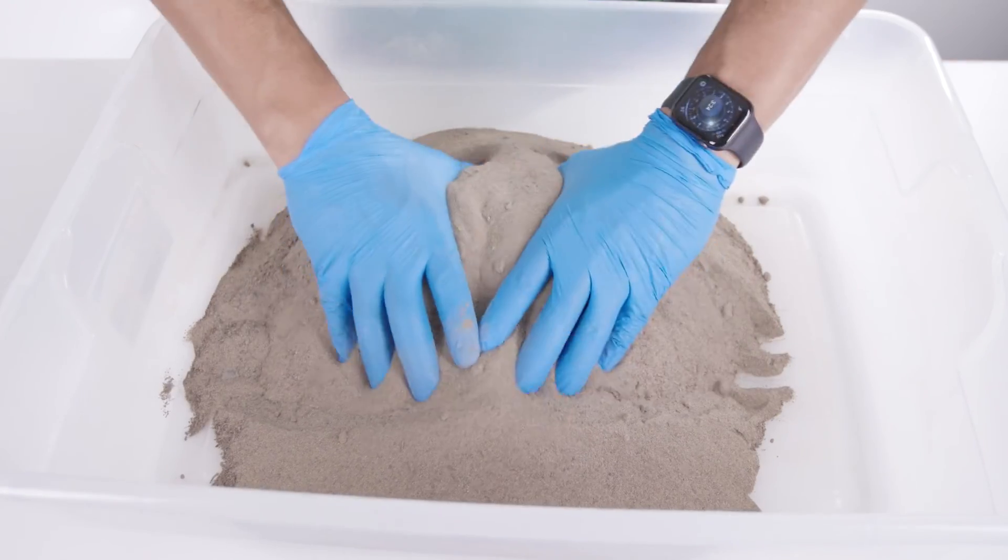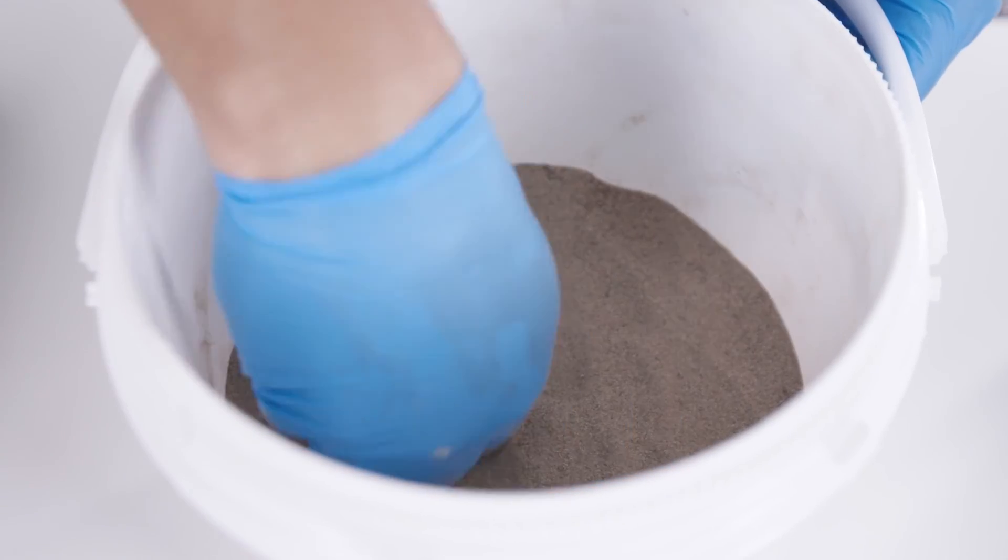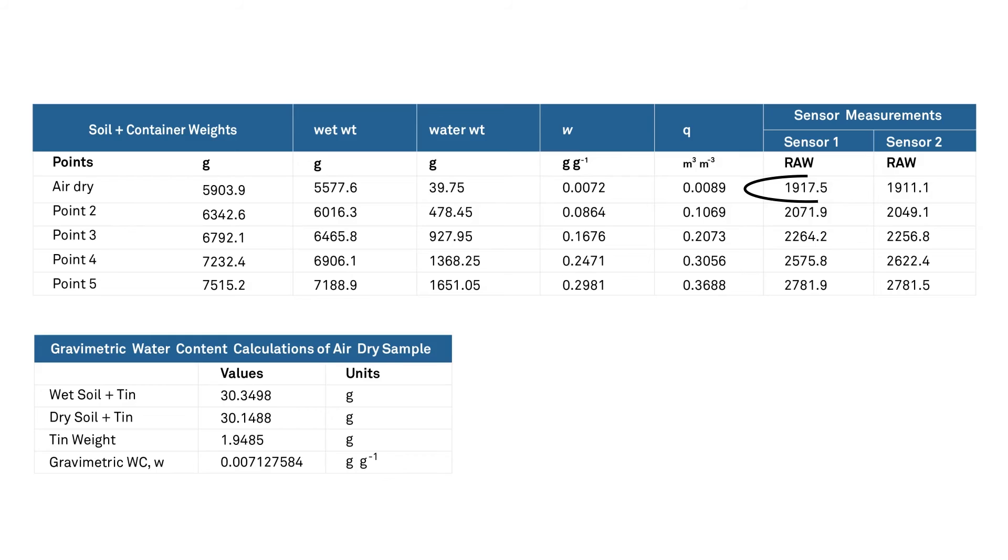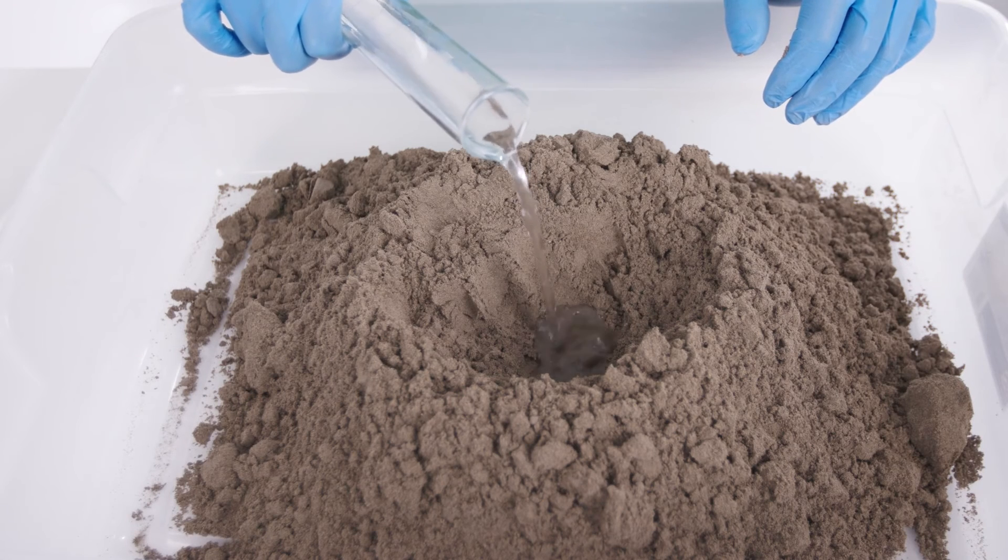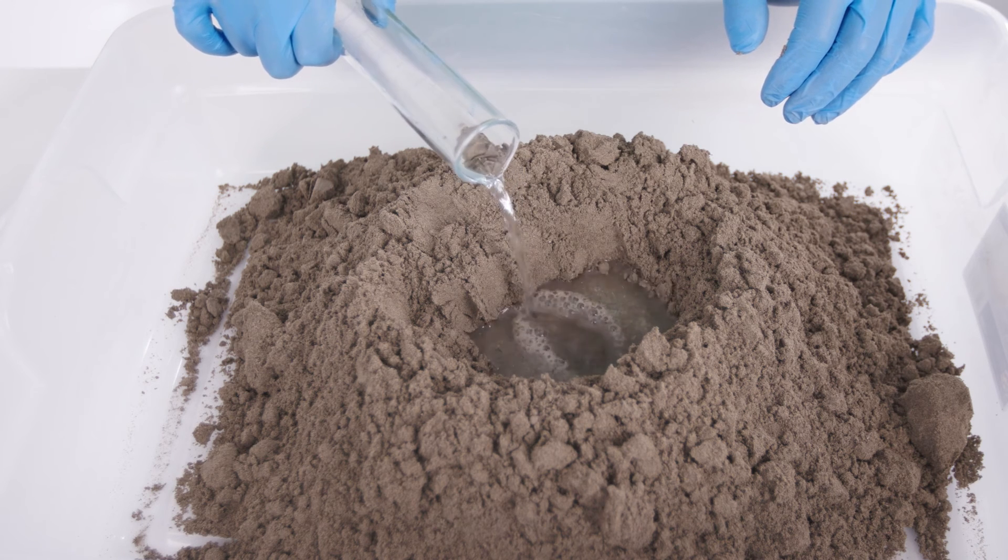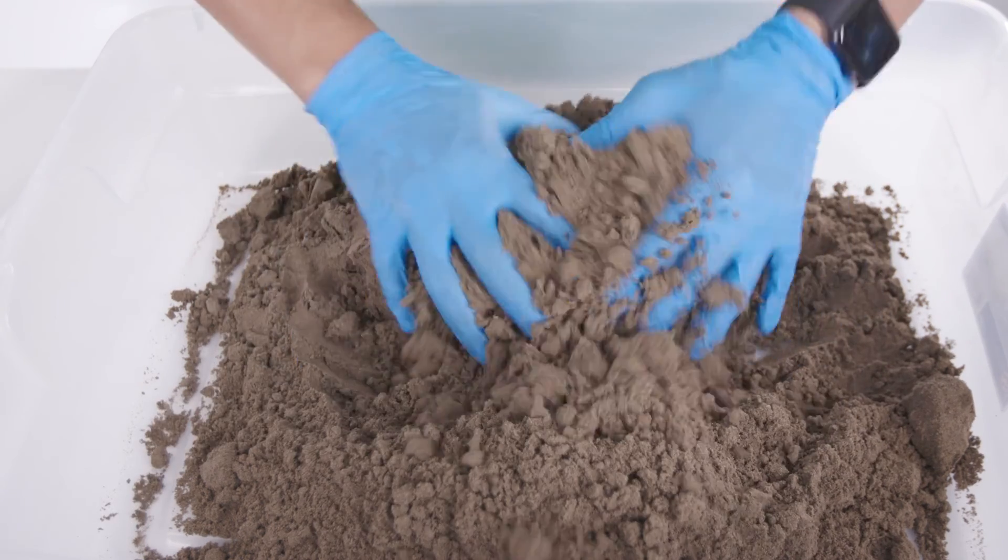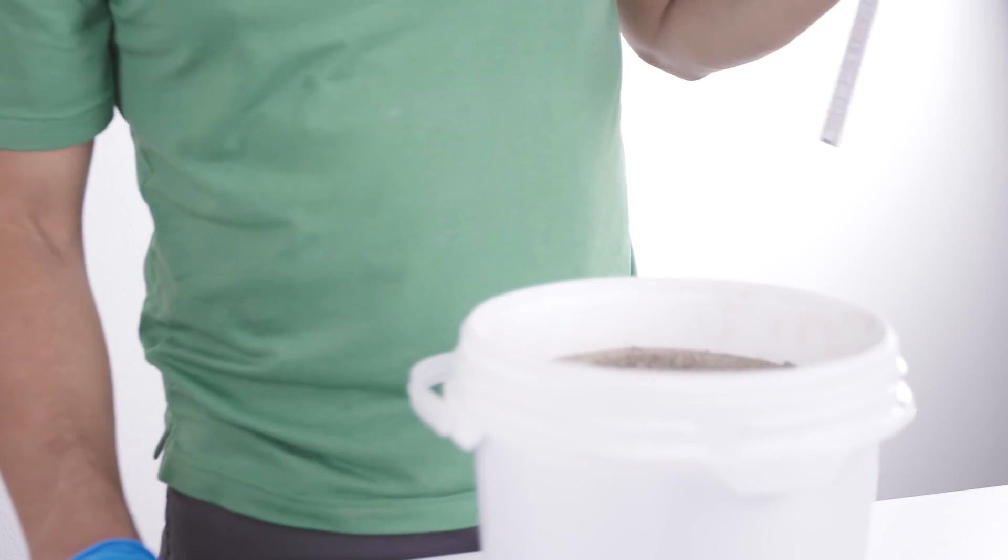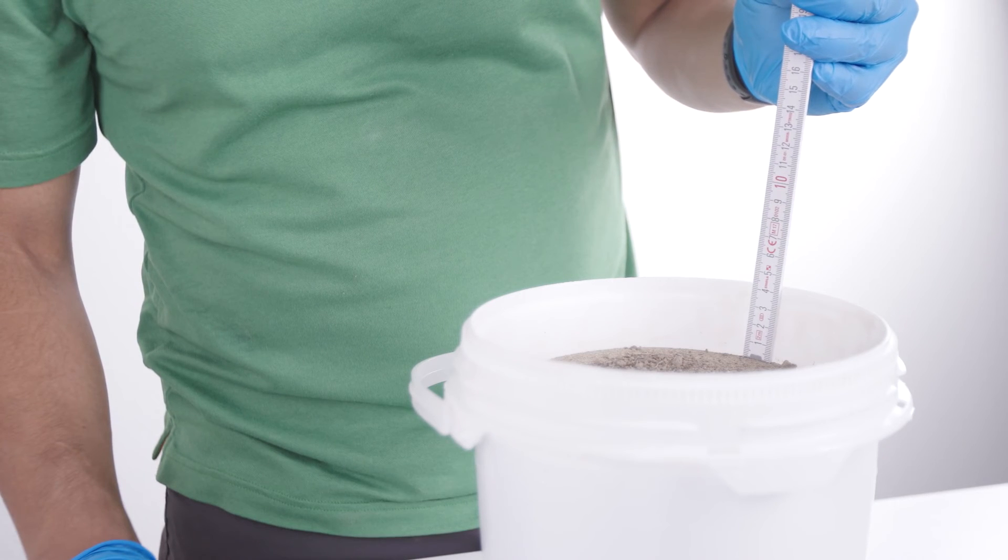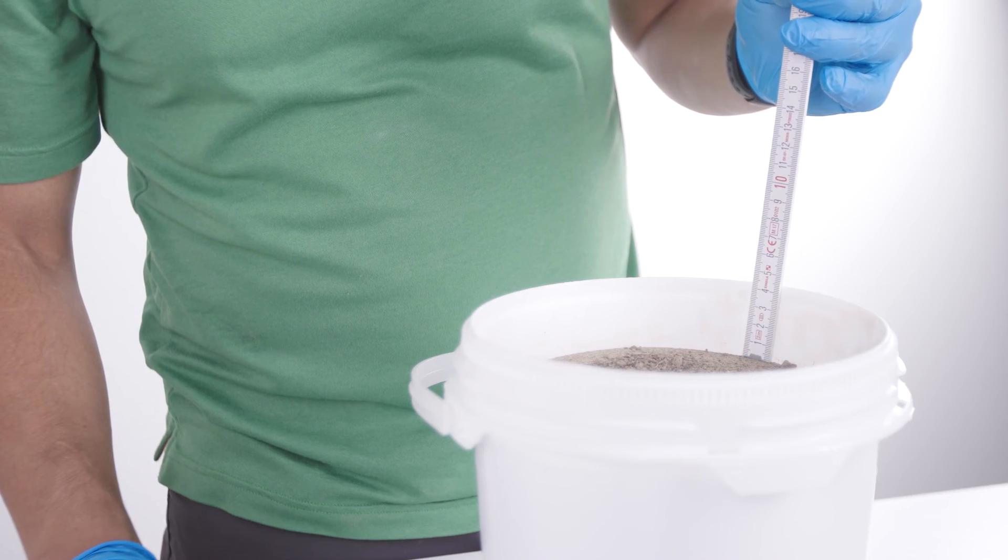Thoroughly mix the soil with your hands or a trowel until the mixture is again homogeneous. Repeat the steps of packing the soil, inserting the sensor, taking a reading, weighing, and recording. Then again, increase the volumetric water content by 10 percent. Repeat these steps until the soil nears saturation. This generally yields 4 to 6 calibration points. Each point may take up to 1 hour. Note that the bulk density of the sample can be maintained throughout the calibration process by packing the same soil sample to the same level on the calibration container at each water content.